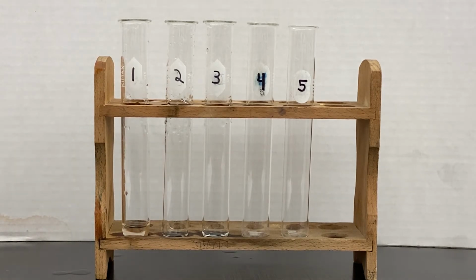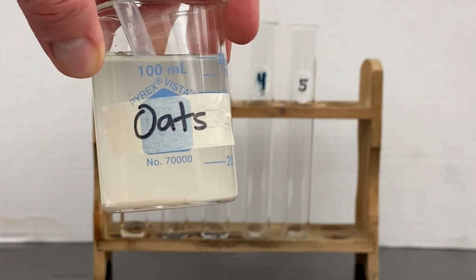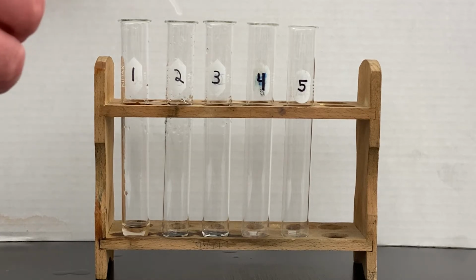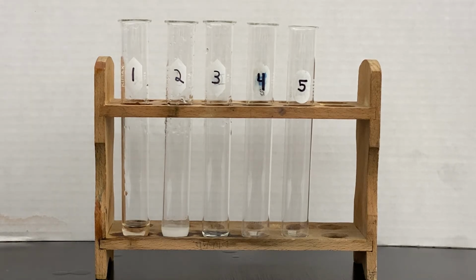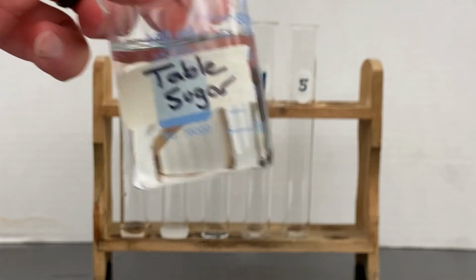And I'm going to put 20 drops of a very watered down oat solution made from oatmeal into test tube number 2. Next, I'm going to take a solution of table sugar and put 20 drops of it in test tube number 3.